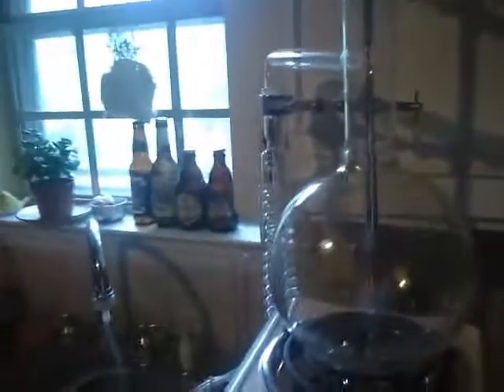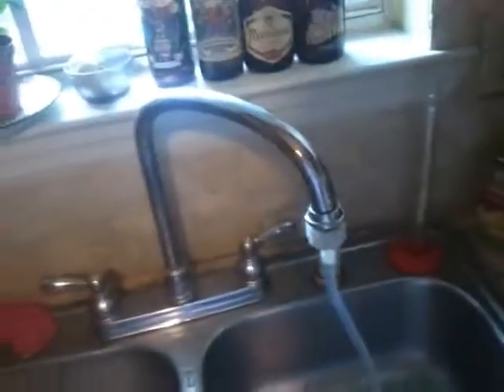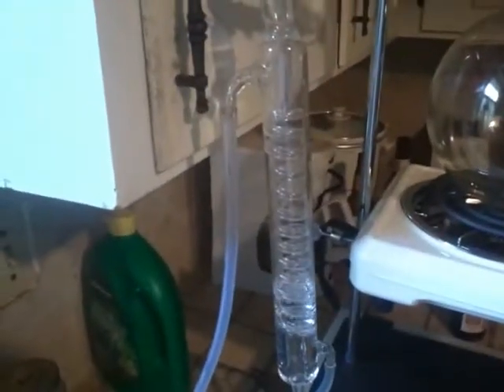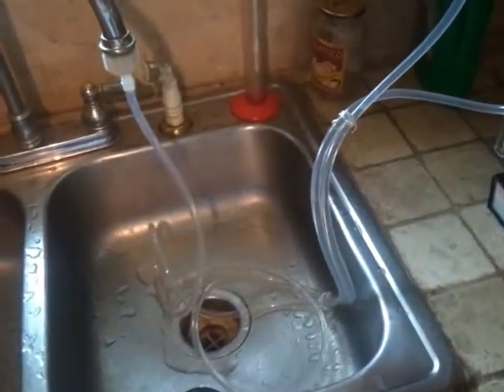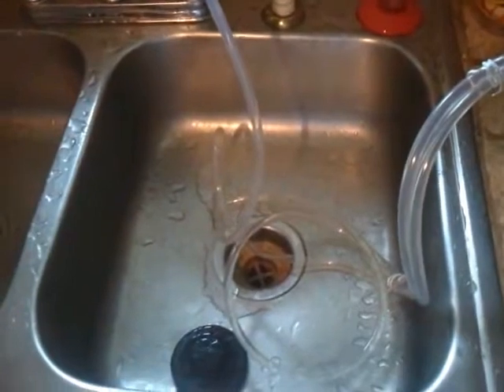This is my 2,000 milliliter glass ethanol still. I'm about to turn on the condenser. It's not as efficient as my pump — my pump doesn't work anymore.